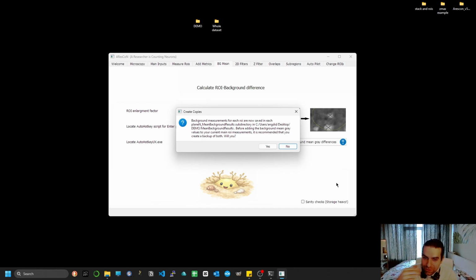And this is the reason I'm creating the convex hull, because the convex hull only gets the tightest region where your neurons or nuclei fit, and by that you can turn any other values of the image to none. And this is what Arescon does here. Actually, it turns values of ROIs and values of background to none. And I will show you now.